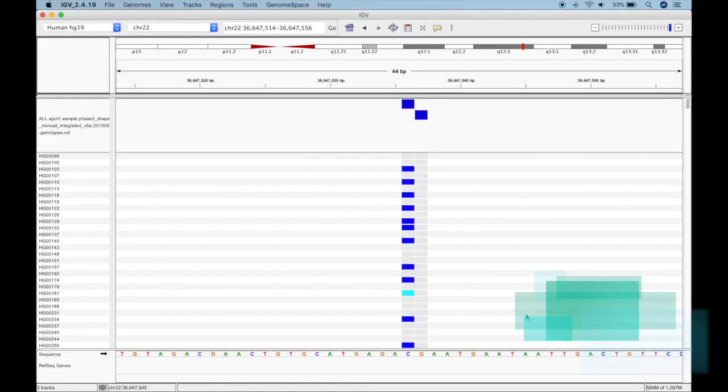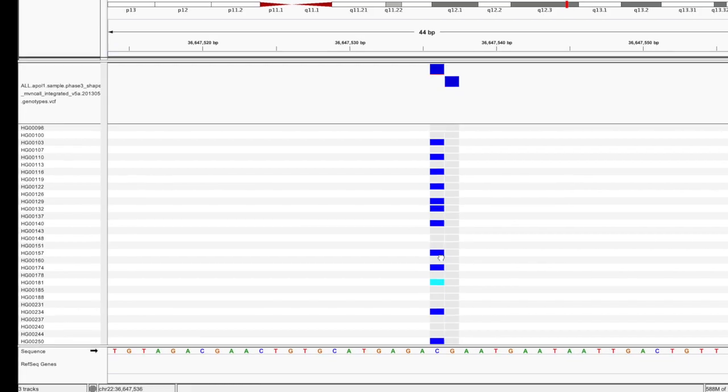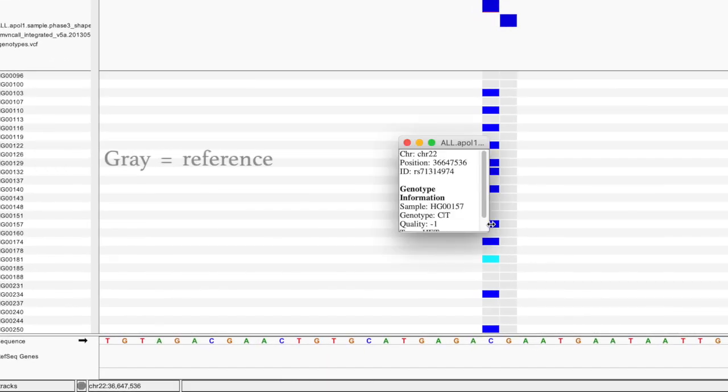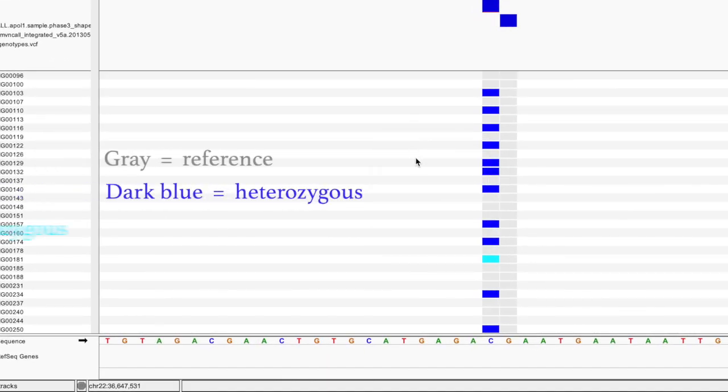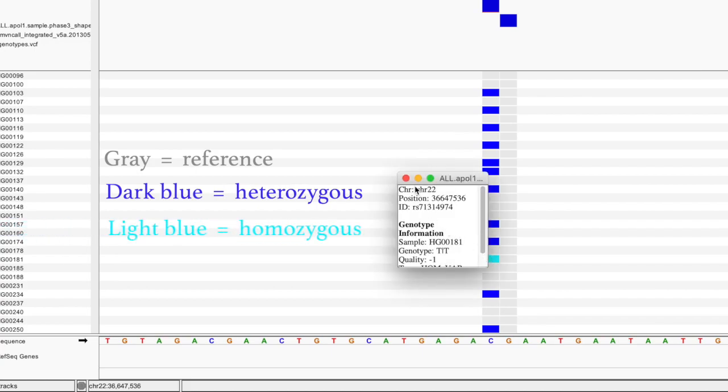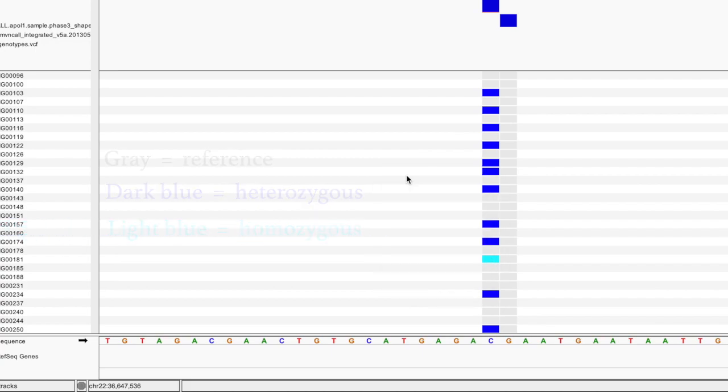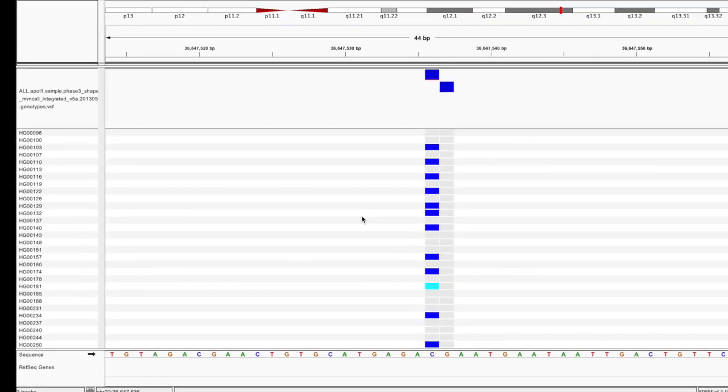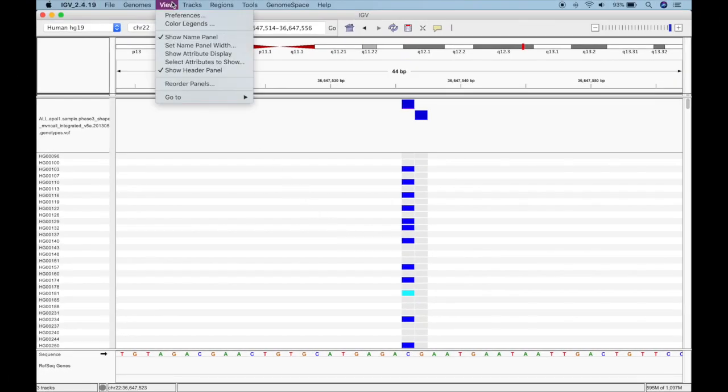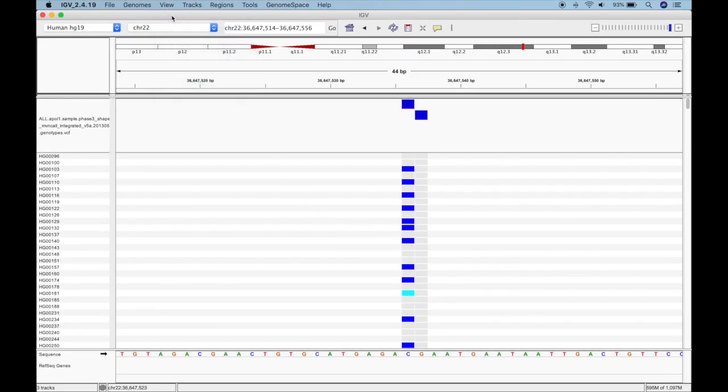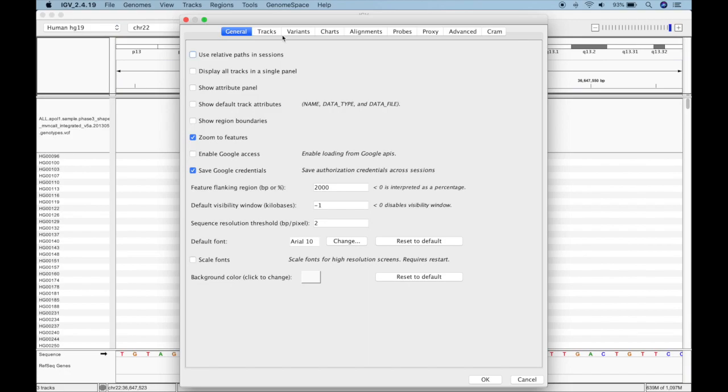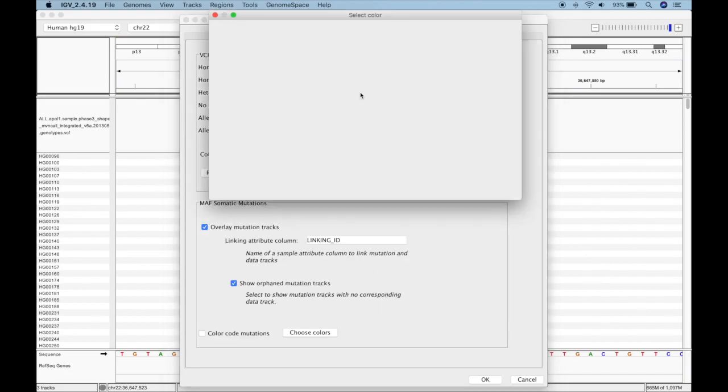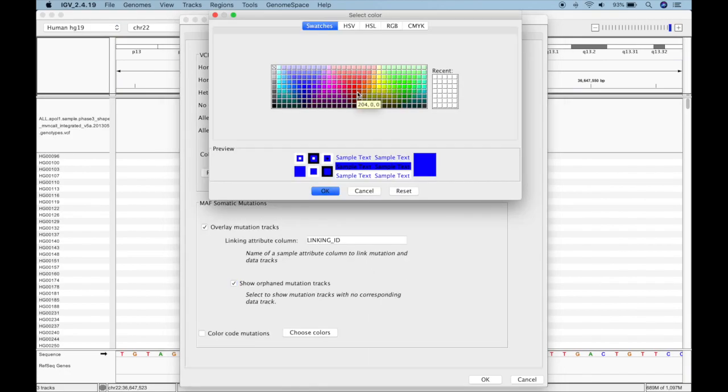As with sequencing data, gray means reference. But here, dark blue indicates a heterozygous variant, and light blue indicates a homozygous variant. If you don't like these colors, you can change them by going to View, Preferences, Variations, Variants, and Choosing New Colors.